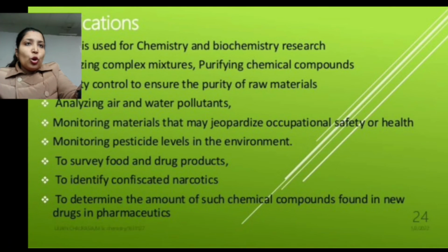Now, applications of HPLC. In pharmaceutical applications, it is used in tablet dissolution, shelf life determination of pharmaceutical products, and pharmaceutical quality control. In environmental applications, it is used for detection of phenolic compounds in drinking water, biomonitoring of pollutants, and identification of diphenhydramine in sediment samples. In forensics, it is used for the determination of cocaine and metabolites in blood, identification of anabolic steroids in serum, urine, sweat, and hair, and quantification of drugs in biological samples.